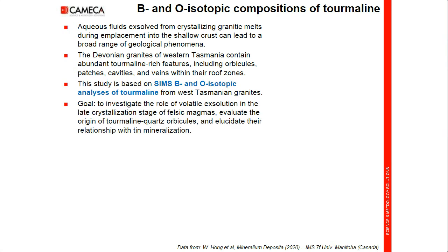This study is based on SIMS boron and oxygen isotopic analysis of tourmaline from West Tasmanian granite. The goal was to investigate the role of volatile exsolution in the late crystallization stage of felsic magmas, evaluate the origin of tourmaline quartz orbicules, and elucidate their relationship with tin mineralization.